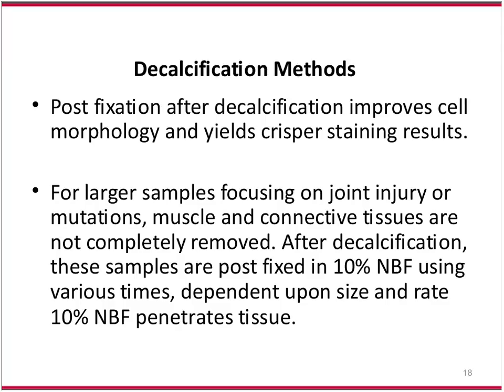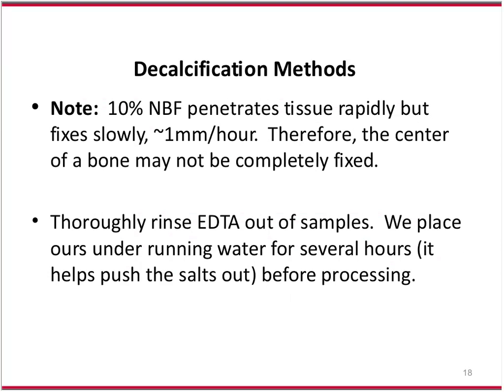Obviously, decalcification is going to take longer with a larger sample, as well as fixation is going to take longer with a larger sample. 10% NBF penetrates tissue rapidly, but fixes slowly, about 1 millimeter per hour. So that really needs to sink in. Most of us already know this, though, that it penetrates tissue rapidly, but fixes slowly. Therefore, the center of the bone may not be completely fixed.